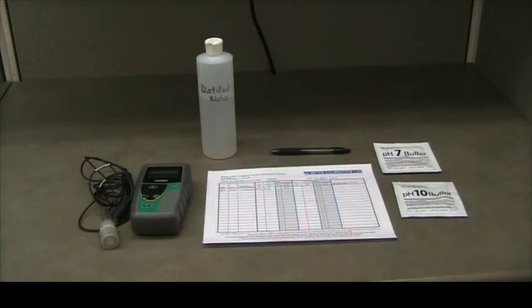Before using the pH meter in the field, it must be calibrated. We will use the pH 7 and pH 10 buffer solutions to calibrate the meter.